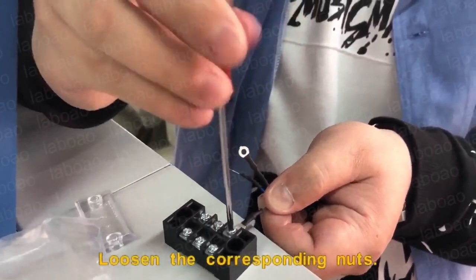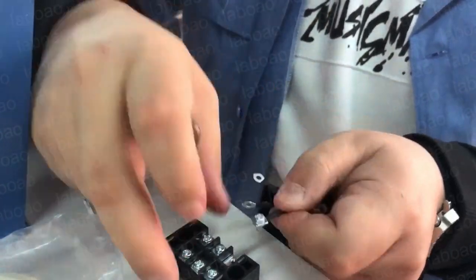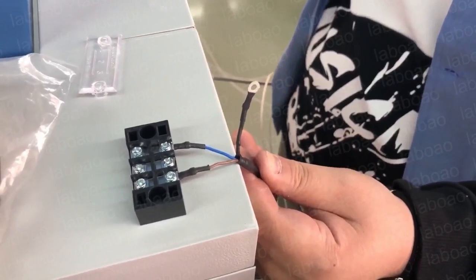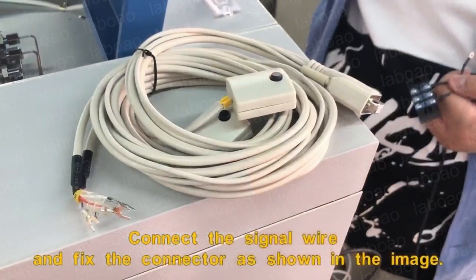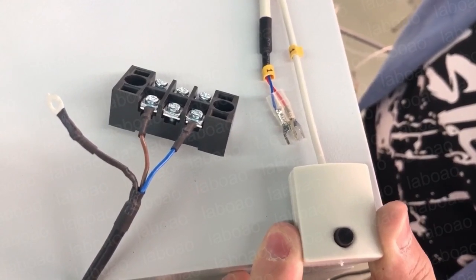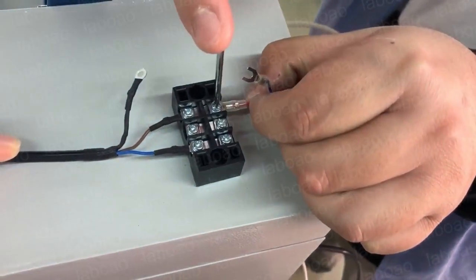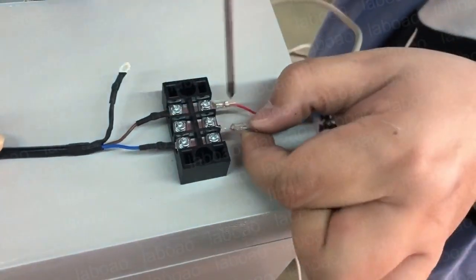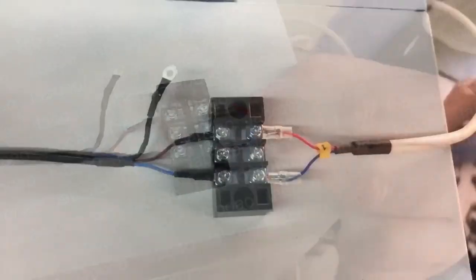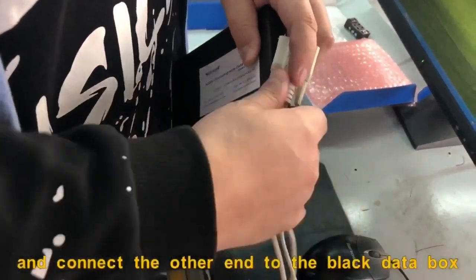Loosen the corresponding nuts. Connect the signal wire and fix the connector as shown in the image. Continue to connect the signal line, and connect the other end to the black data box.